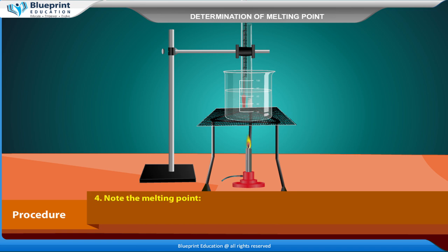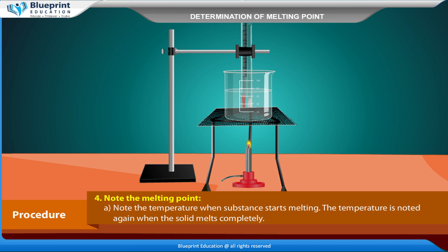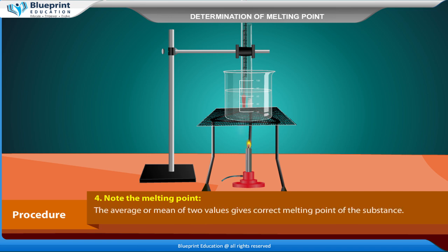Note the melting point. Note the temperature when the substance starts melting. The temperature is noted again when the solid melts completely. The average of these two values gives the correct melting point of the substance.